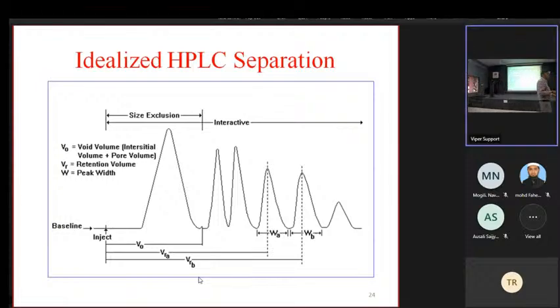Calibration. We have different methods of calibration for HPLCs. For example, as per the IP, the Indian Pharmacopoeia, we have some techniques. Any instrument, not only HPLC, has calibration methods, even the balance. You're using the balance, the pH meters, and some instruments like nephelometry and turbidimetry. There are specific calibration methods, and you need to repeat that calibration.